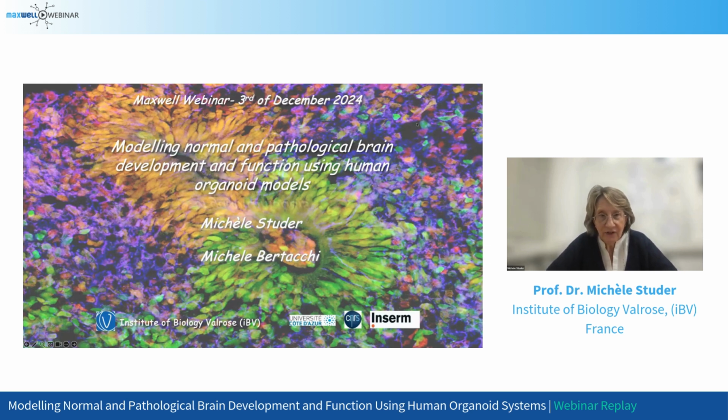So the title you know already. The plan is that we do a general introduction about two projects that we are following in the lab, using organoids and using the MEA system. And Michele, who is doing the real job, and actually not me, is going to talk in more detail about how we use the MEA in our organoid system and the beautiful results that we got.